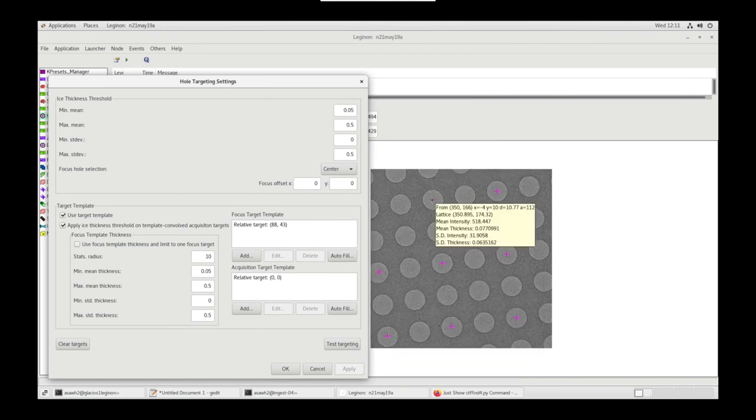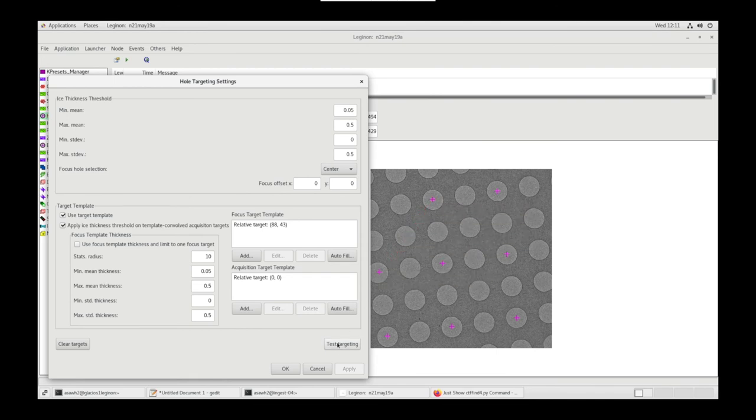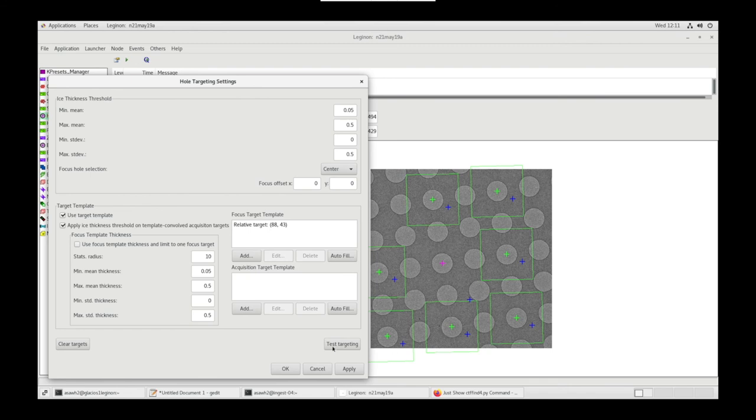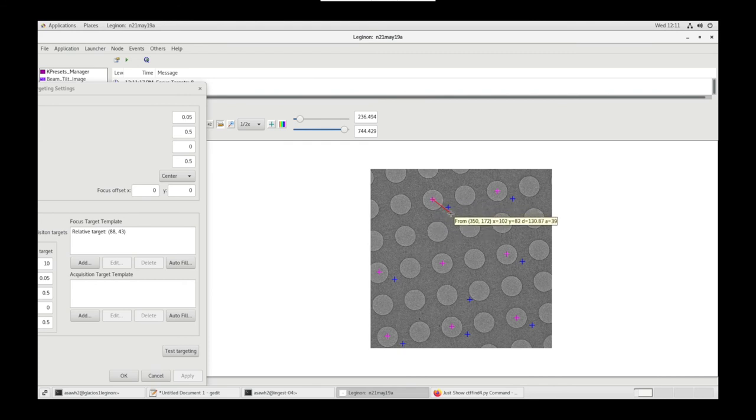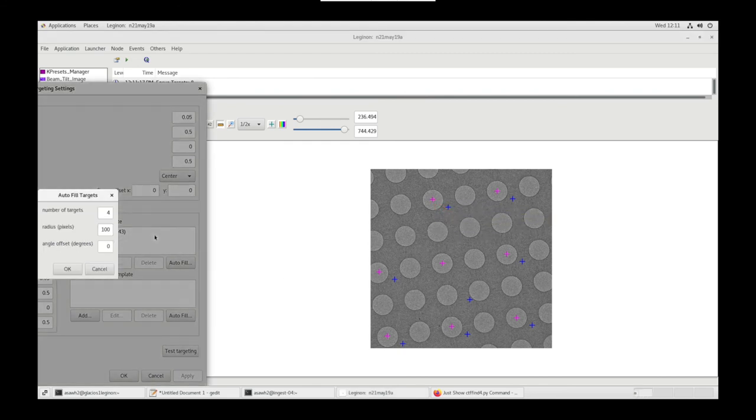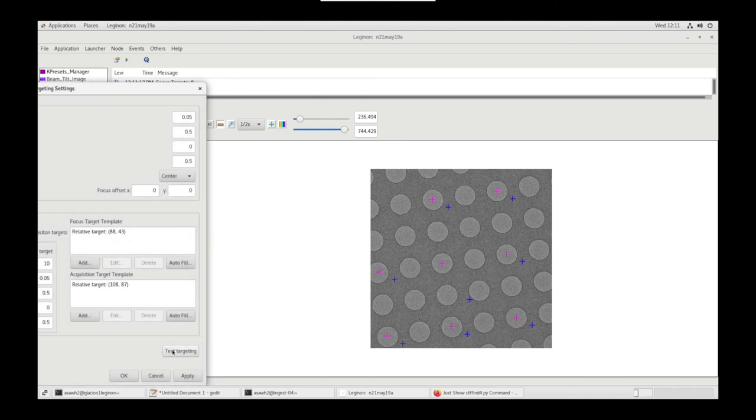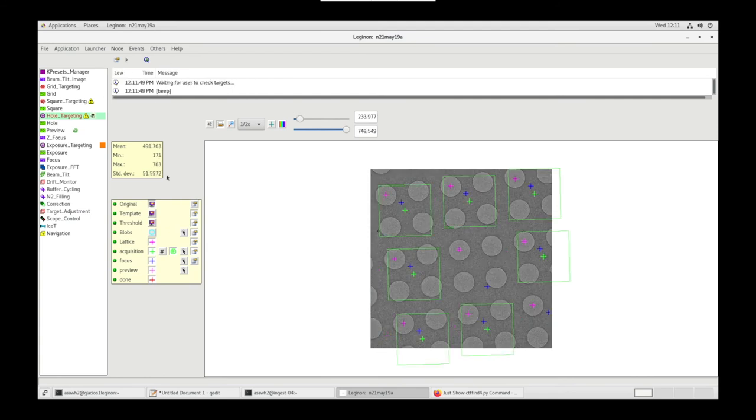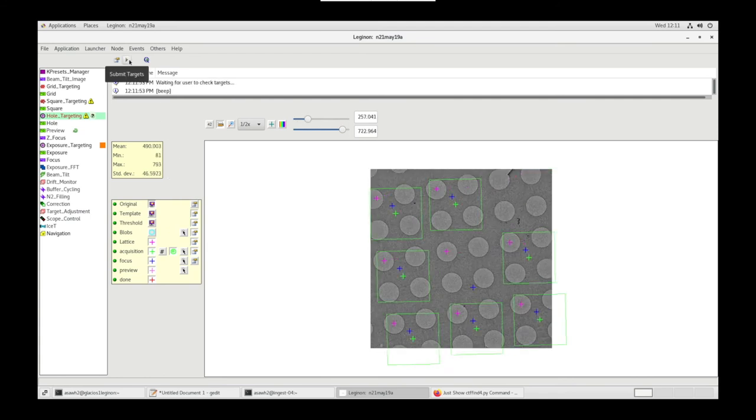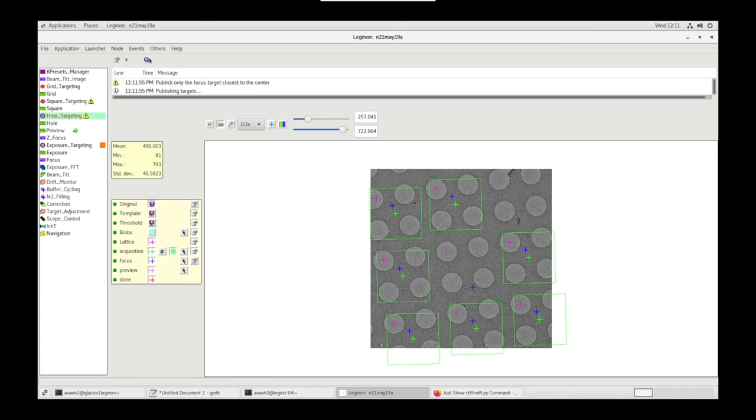If you hover over a lattice point, you can see the Mean Intensity, Mean Thickness, Standard Deviation Intensity, and Standard Deviation Thickness. Let's delete our Acquisition Target. Let's measure from our lattice point to the center of four holes. Let's input the D value here and the A value here, and we only want one target. Now we're getting four holes for each Acquisition Target. Submit Target, and let's repeat this for each square that we picked in Square Targeting. Now submit the queue.